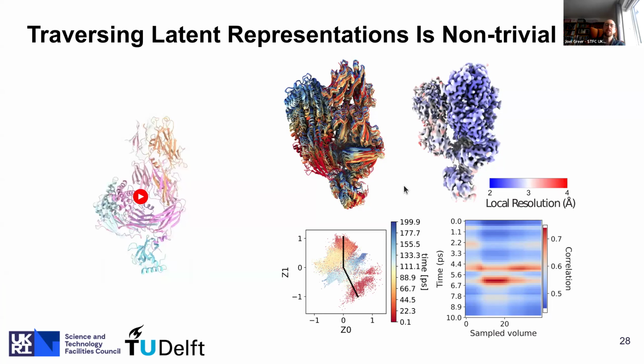So from this MD simulation, you might expect that potentially a heterogeneous reconstruction algorithm might be able to find 3 more discrete clusters of conformational arrangements in the latent space embedding. So here I just show as well an ensemble of some of these states throughout the simulation.